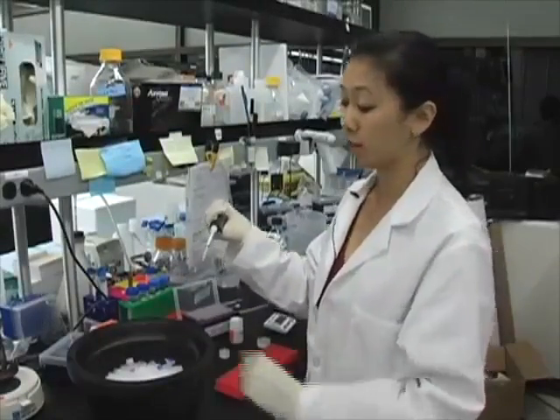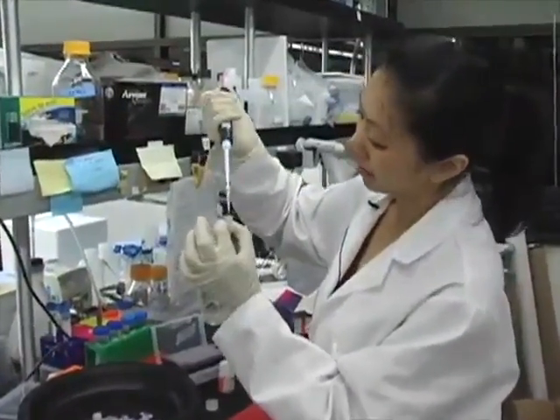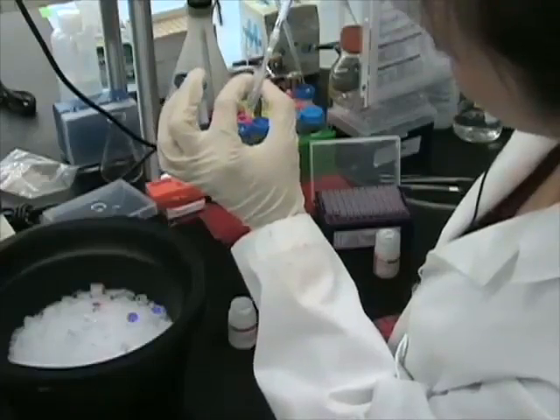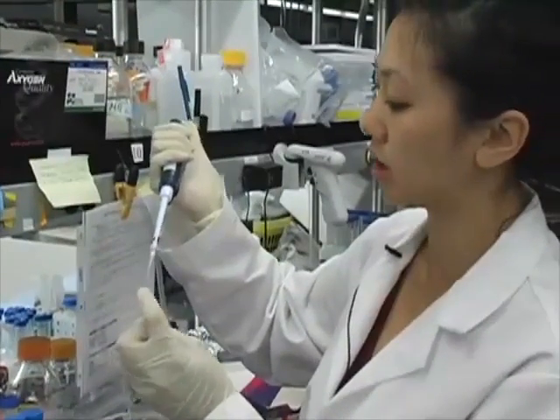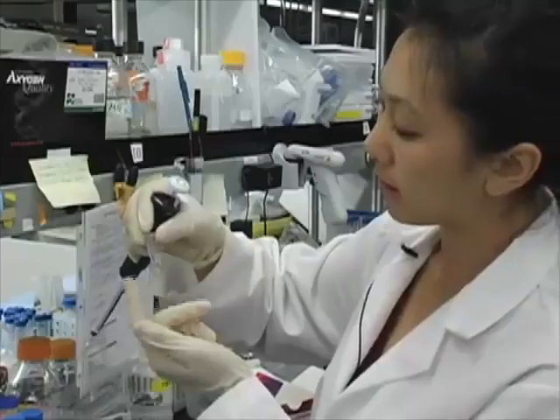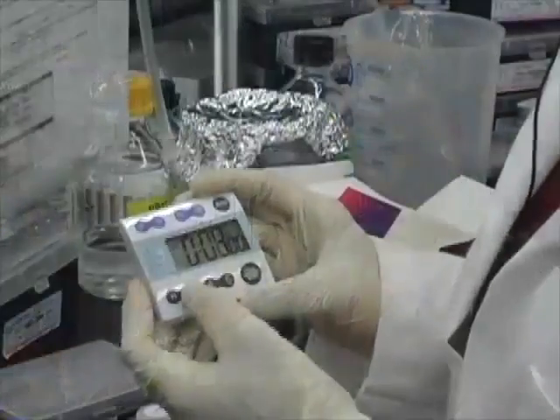And so you're going to want to add 125 microliters of your master mix to your tissue of interest, making sure that if it's an adult mouse tail, the cut end is completely submerged in the master mix solution. And you can finger vortex it, and you incubate it at room temperature for 10 minutes.